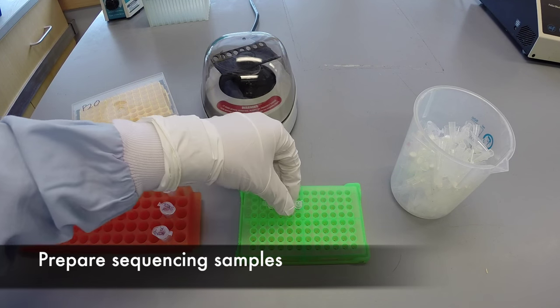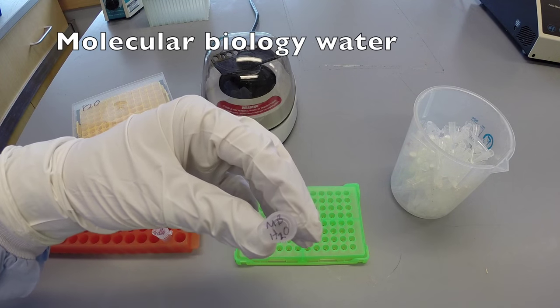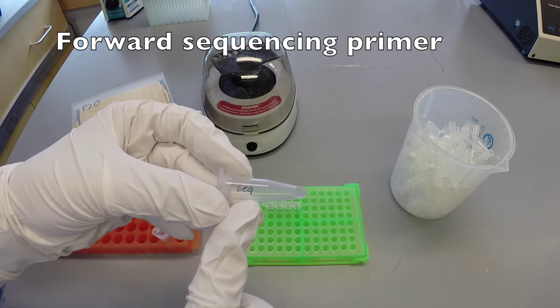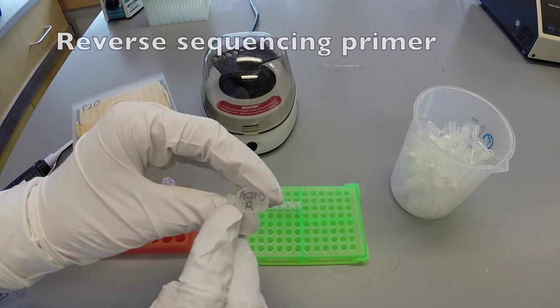To complete sequencing sample preparation, you will need water and forward and reverse primers that are labeled Seq, indicating the concentration necessary for the sequencing reaction.